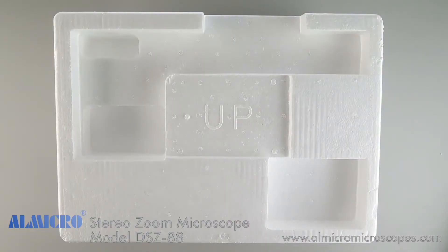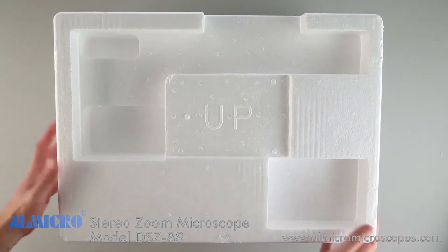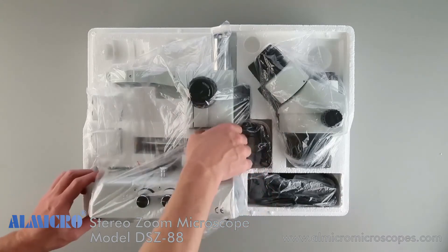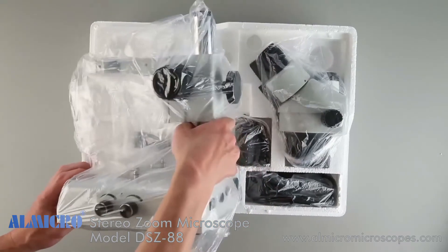Before packing the microscope, look for the word 'up' or an arrow, which designates the top. Inside the box you'll find all the components you need for this microscope, which include the body, a head, a pair of eyepieces, a lighting module, a trinocular port, and various other accessories.